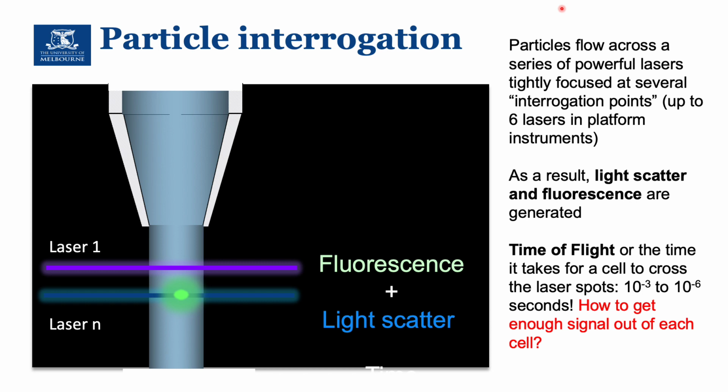Now, something that is important to take into account is that the velocity of the flow dictates the time of exposure. Since everything is defined by the design of the instrument, and the velocity is also conditioned by the design of the flow cell, the exposure time in cytometry is a fixed value, and typically can be from a few milliseconds to a few microseconds.